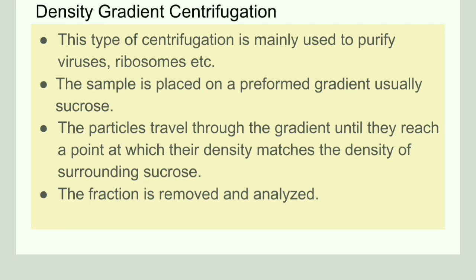So next we will discuss density gradient centrifugation. This is commonly used to purify viruses, ribosomes and molecules such as DNA.